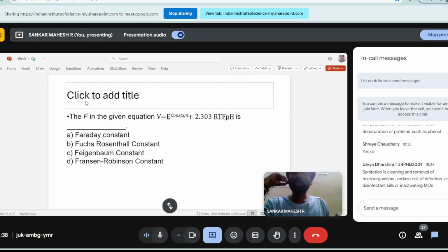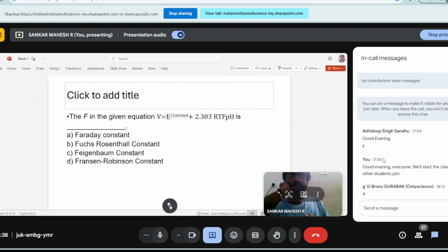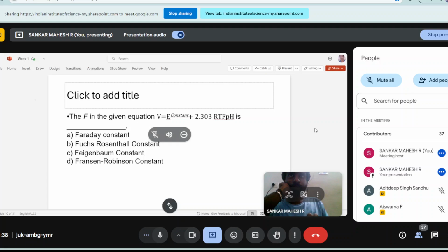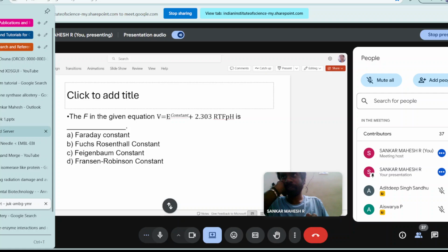Where did you get velocity or speed from? Not velocity, V is voltage. Okay. Then E is based on the electric charge, or the movement of electron maybe. And here I think pH signifies the amount of positive hydrogen ions which is present. And T stands for a particular temperature. So altogether, the relationship between voltage and current and the molecule, I guess this is the Faraday constant, sir.